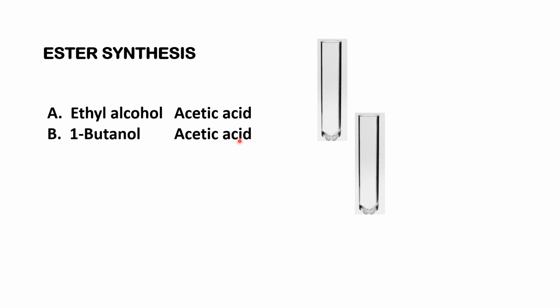Or you can estimate 20 drops is equivalent to 1 ml and 60 drops is equivalent to 3 ml. 1:3 tayo. Okay? Then you will be adding 2 drops into each test tube, 2 drops of concentrated sulfuric acid. 2 drops again.